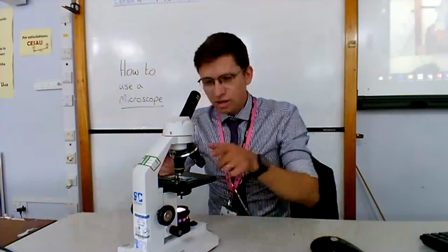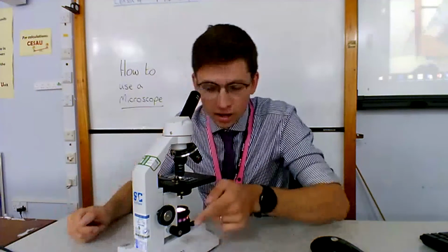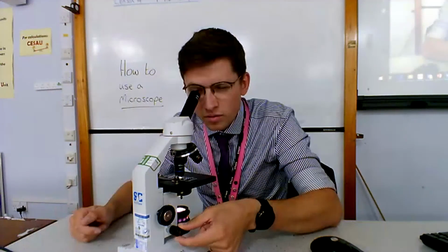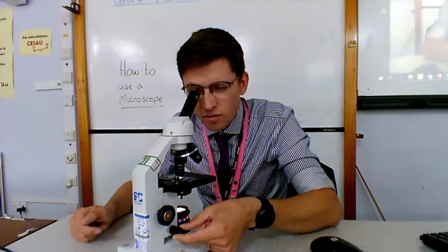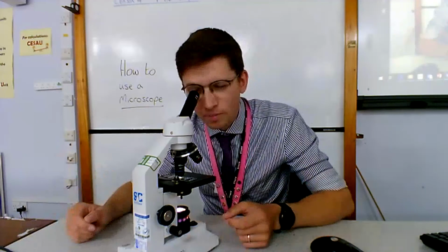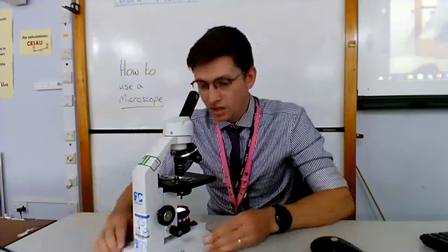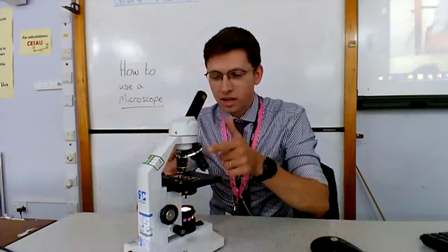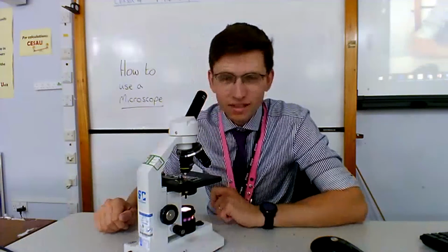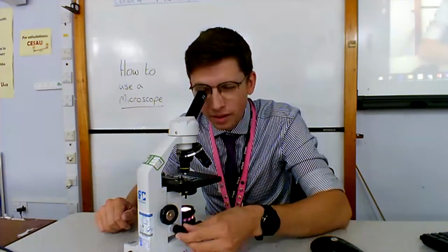And I could go one step further and go to my highest magnification and use my fine focus wheel one more time to really focus in and really magnify my image so I can see bigger images of cells. This magnification lens is the most tricky to work. So you might find that you are perfectly happy with the middle magnification objective lens, which is 10. So I'm just going to get my picture back.